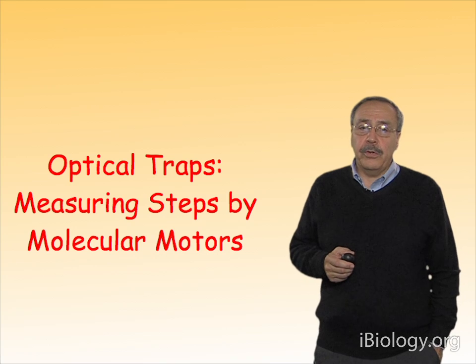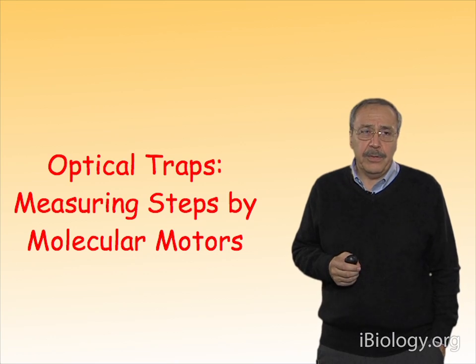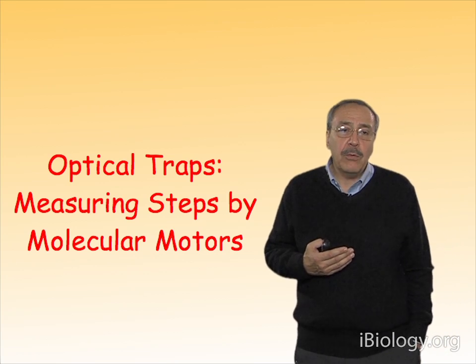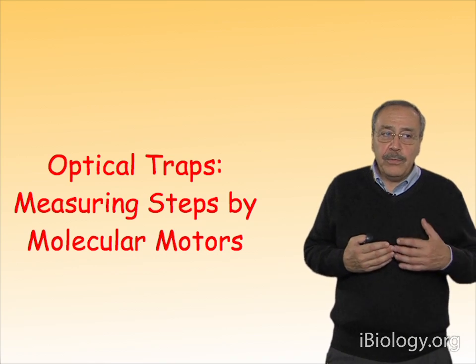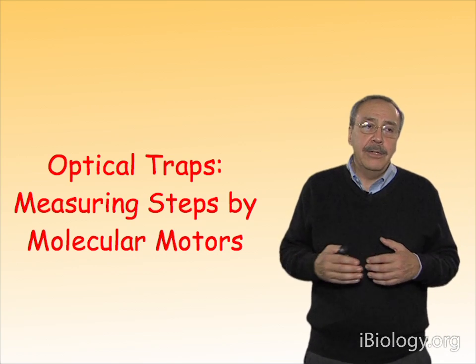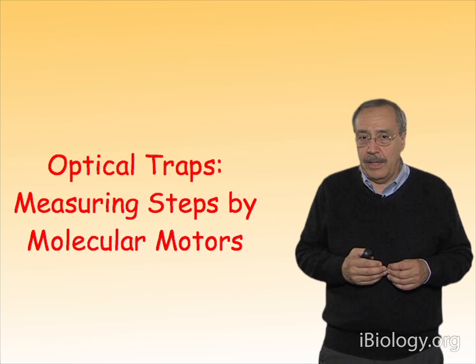Okay, next we are going to talk about the resolution, the spatial resolution of optical traps. And this is an important consideration because, of course, ultimately what we are interested in is being able to actually follow processes in biology, molecular processes that we can follow in real time. And if we want to see those molecular processes, typically they involve a conformational change or the movement of a motor on a track or some kind of displacement of a given magnitude that we want to be able to detect with the optical tweezers.